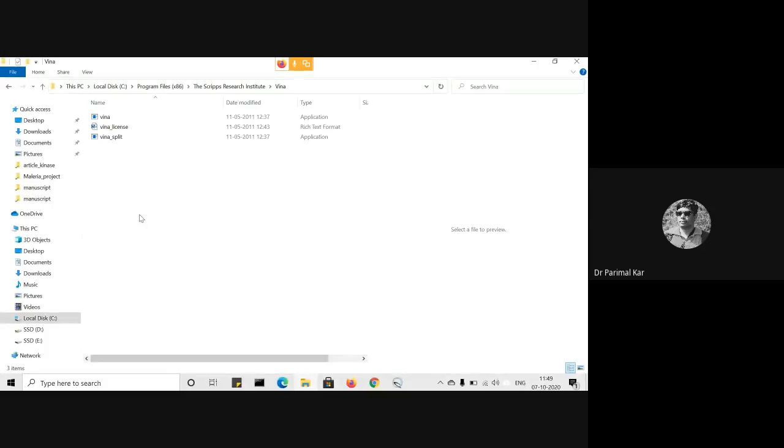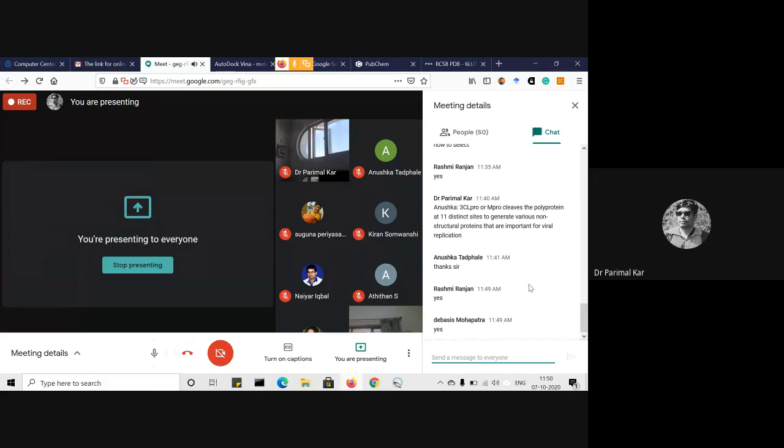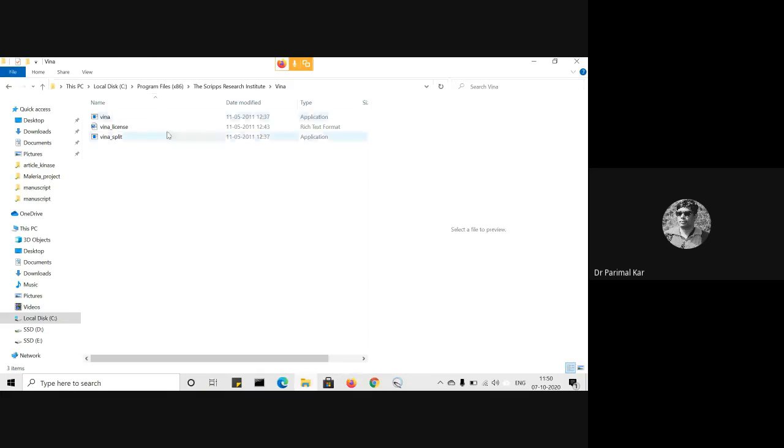Okay, so everybody got this? Vina, Vina license, and Vina split. Okay, fine. Next, you have to copy these three files. Select and copy.